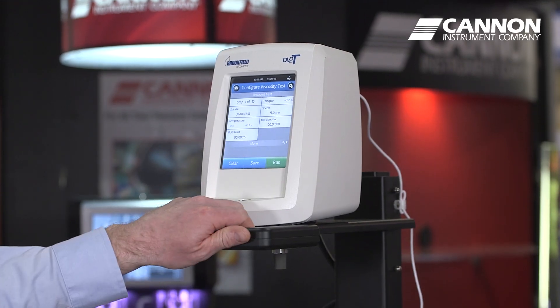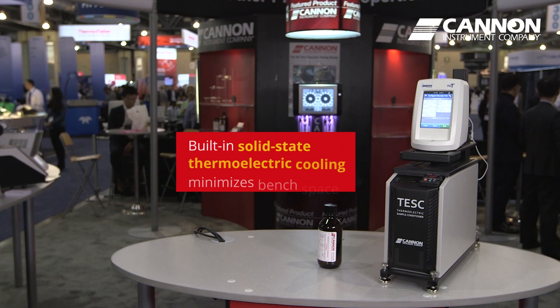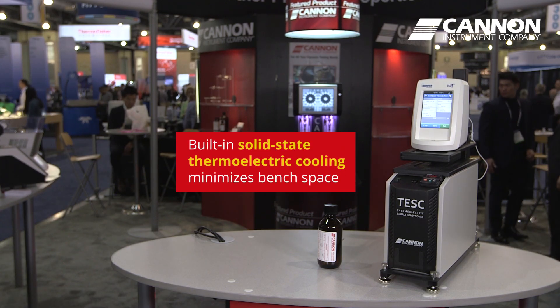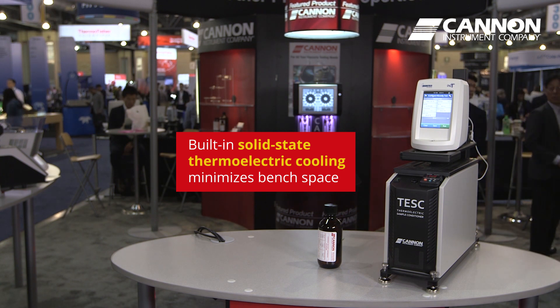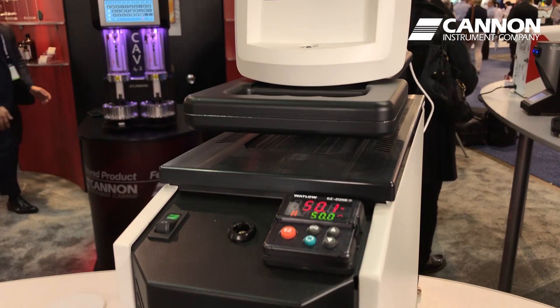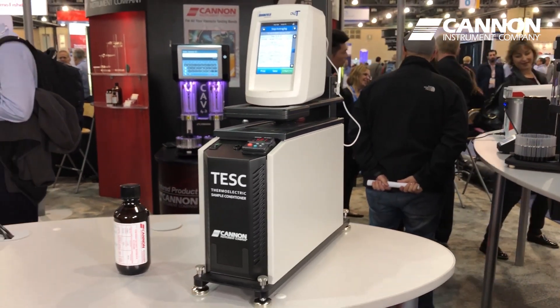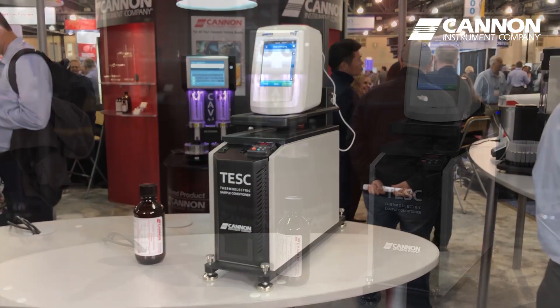The concept for our technology was to develop an affordable benchtop apparatus with built-in solid-state cooling which minimizes the amount of required linear bench space. This allows customers an opportunity to set up multiple units side-by-side, taking up less bench space than the traditional D2983 apparatus.